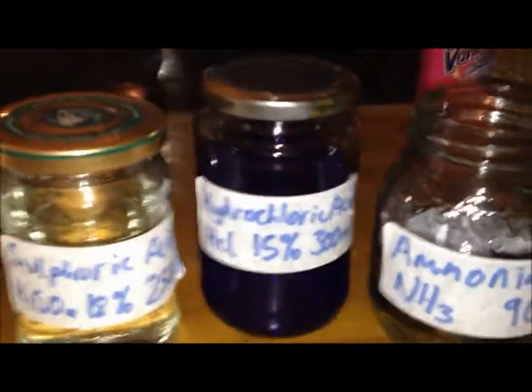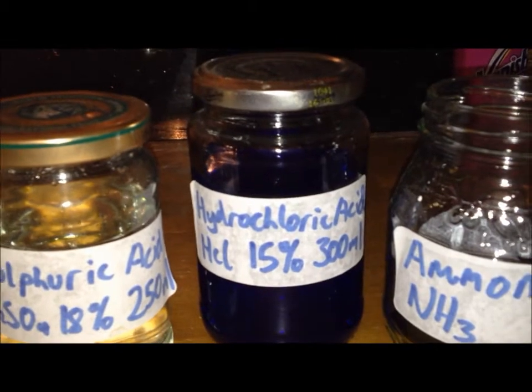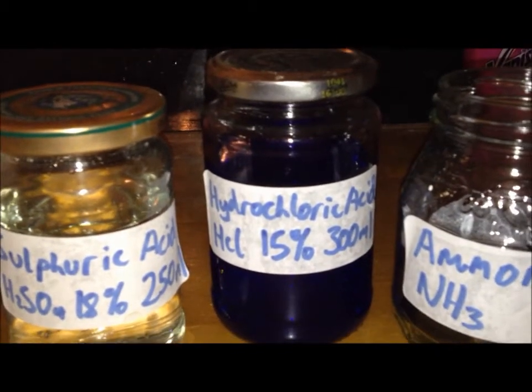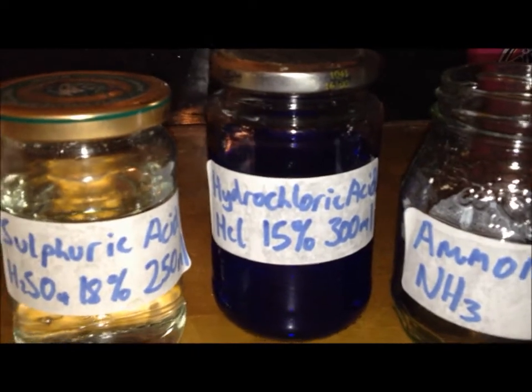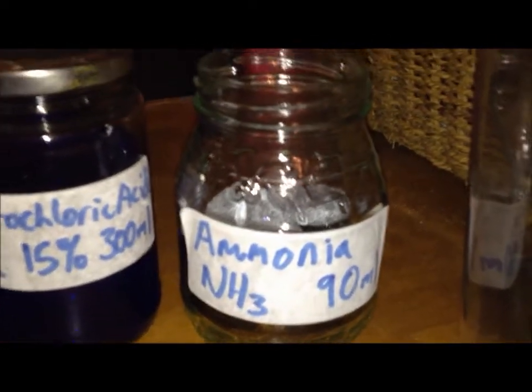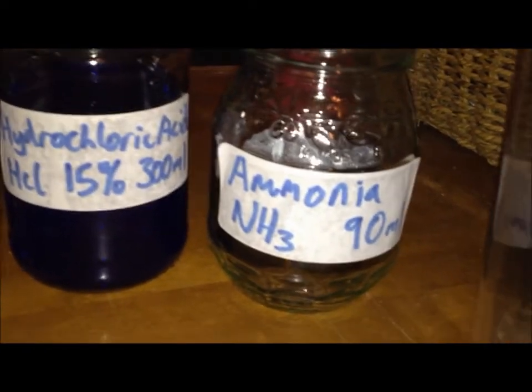This is my hydrochloric acid — it's actually a toilet cleaner, so it's quite impure with a lot of perfumes and stuff in it, but it's useful. About 15%. And then finally ammonia — it's quite concentrated, I boiled a lot of the water off in my earlier video.